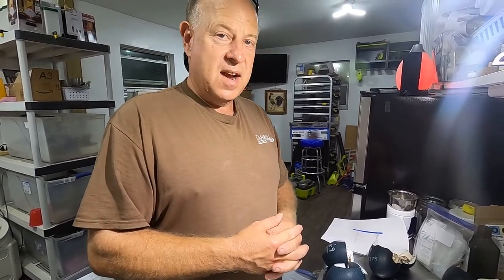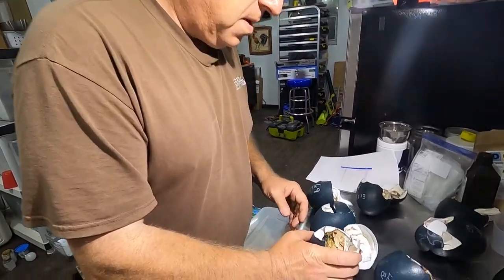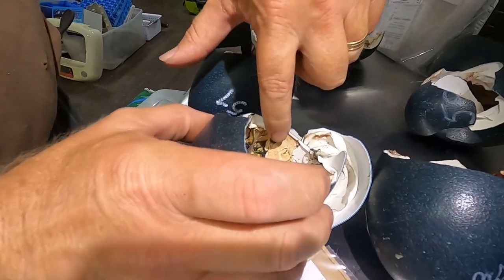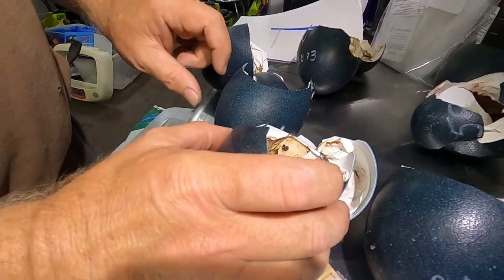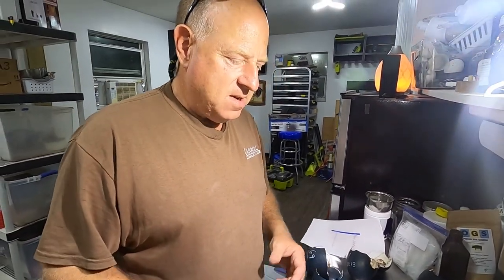I got this same lesson I'm giving you from the folks at Animal Genetics. I'm now making sure that instead of nasty goopy stuff — which is kind of what I thought before; I figured something like that ought to have some DNA in it — nope. What you need is the stuff with some blood on it. What they do is swab out some blood and do the tests on that.